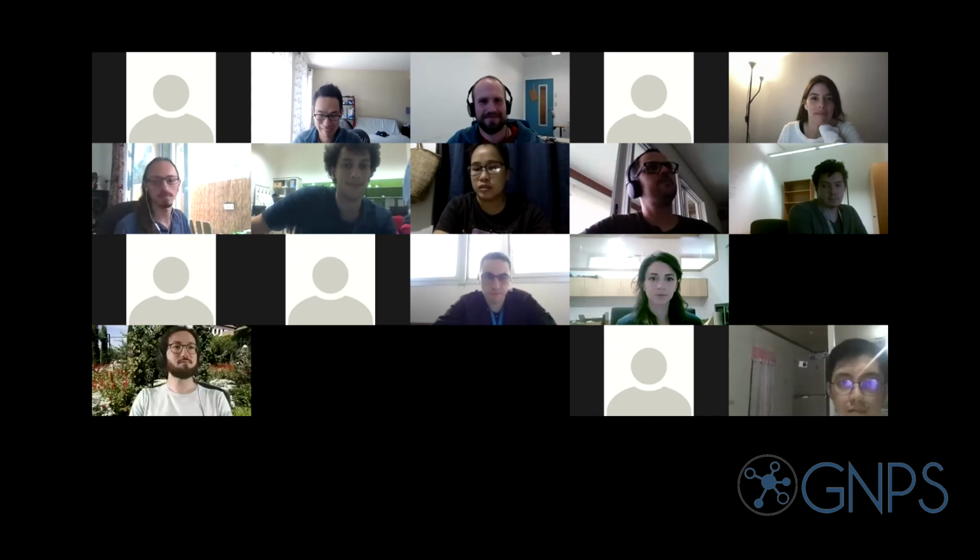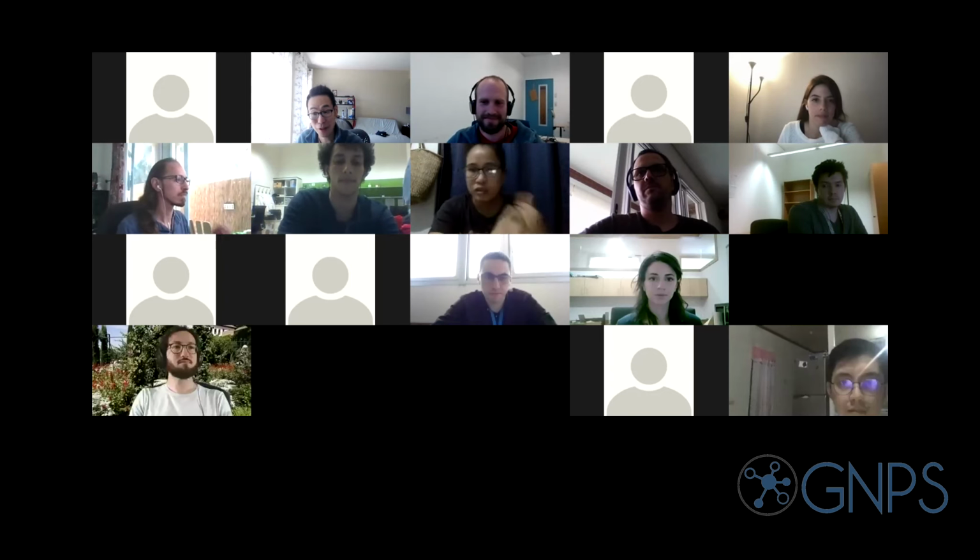I think Savannah made a comment: I work under Dr. Skylar Carlson, and I know she wants to see all the data. This is ideal for that. Yeah, no, that's great. That's great.